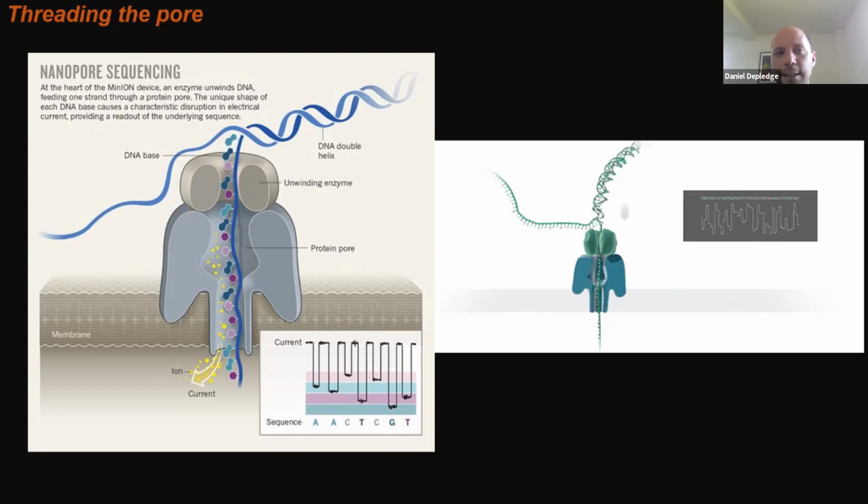So potentially, and probably still a couple of ways from being able to do this perfectly, you would be able to take a piece of DNA or RNA, sequence it, and not only see what the bases are, but also determine which modifications are present. And the ability to do all that in a single sequencing reaction is absolutely incredible, because if you did it with another technology, you would need a number of different library preps and sequencing reactions, a lot of different analyses, whereas Nanopore offers you the potential to do everything all in one go.